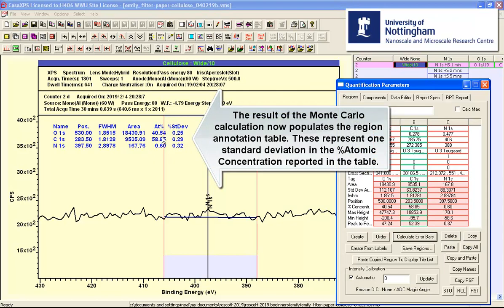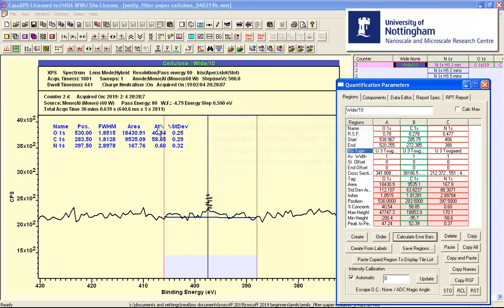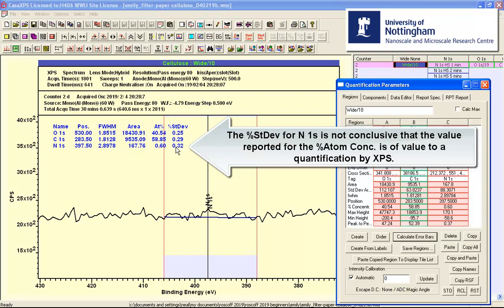We've got uncertainties for the oxygen and carbon that suggest these values are genuine and match the idea that we've got peaks that we can see. Looking at the nitrogen, you can see that the uncertainty is quite large. This is one standard deviation and the value that we've calculated for the nitrogen is more like two standard deviations. So we don't have a high degree of confidence that we've got nitrogen at all based on this value.